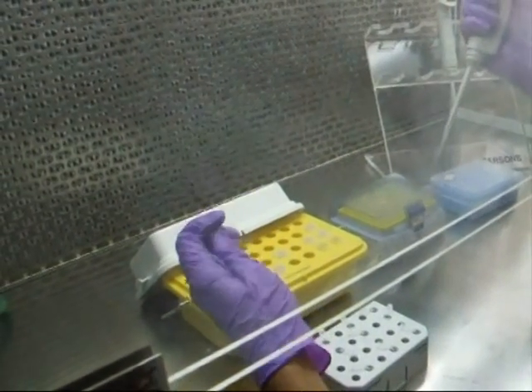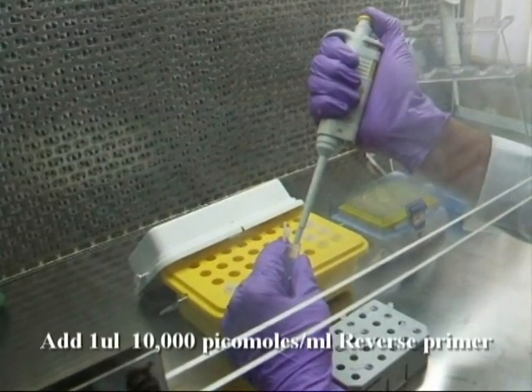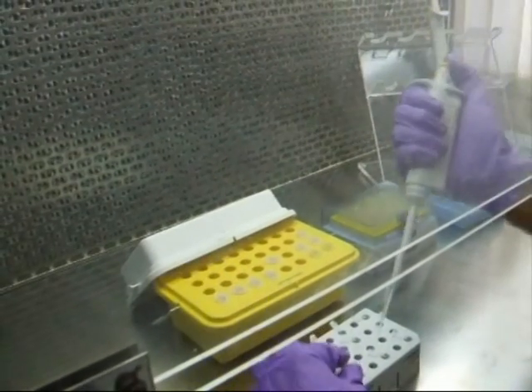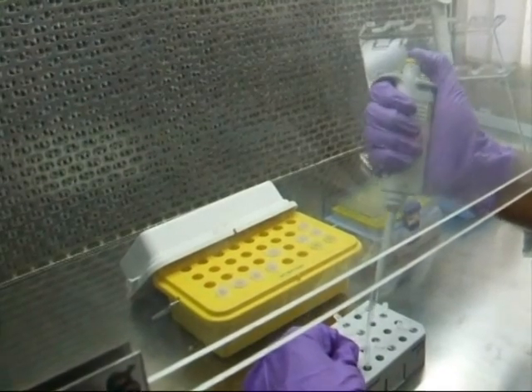A pair of synthetic oligonucleotides are added to prime the DNA synthesis. This quantity is enough for at least 30 cycles of amplification. Higher concentration of primers favor mispriming, which may lead to non-specific amplification.